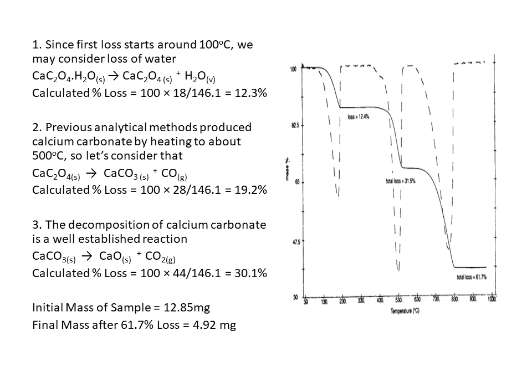Okay, then we increase the temperature and finally we reach about 500 degrees centigrade, when another depression, I mean another change, happens. So calcium oxalate is converted into calcium carbonate by the emission of carbon monoxide as gas. So here the lost molecule is carbon monoxide, and the molecular mass is 28 divided by the total mass multiplied by 100. So the total lost mass in the second step is 19.2%.